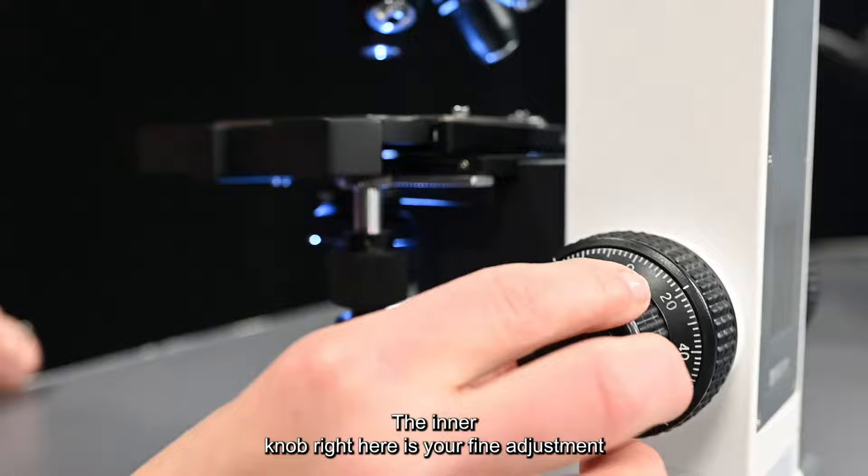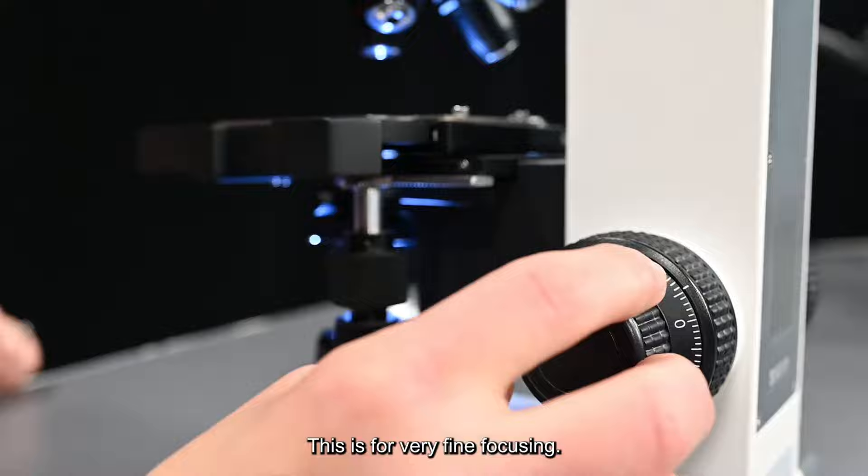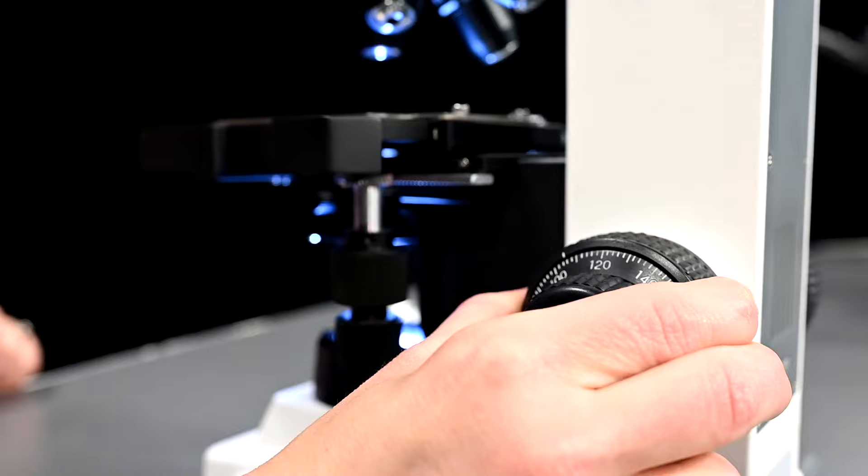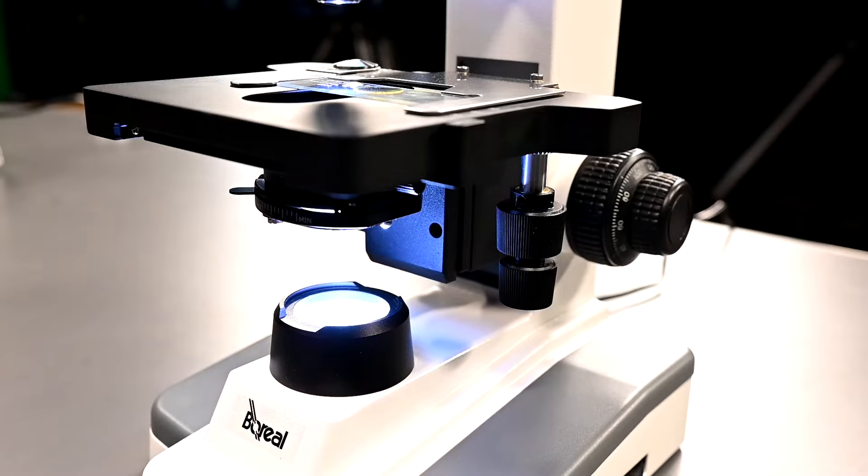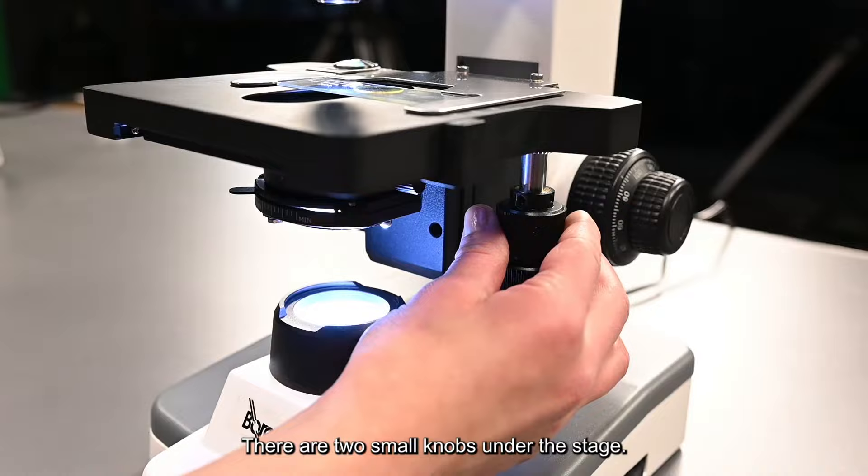The inner knob right here is your fine adjustment and it does not move the stage greatly up or down. This is for very fine focusing. You're going to use your coarse adjustment and you will use your fine adjustment when focusing.